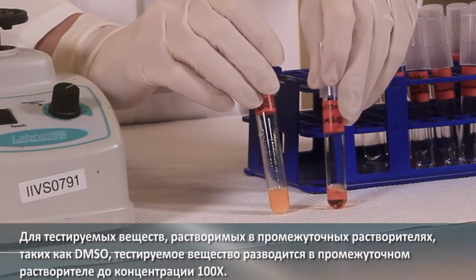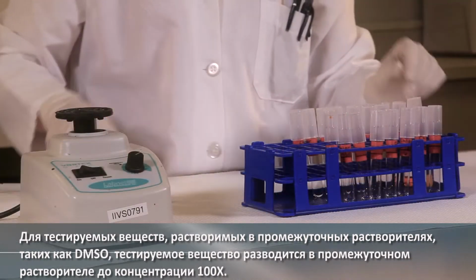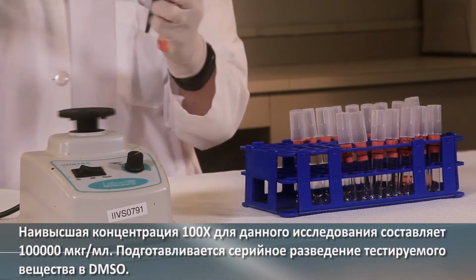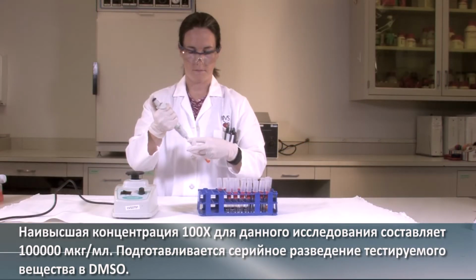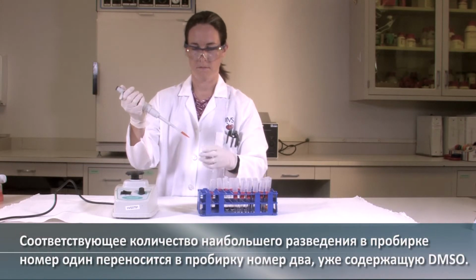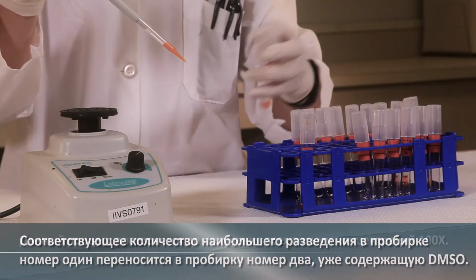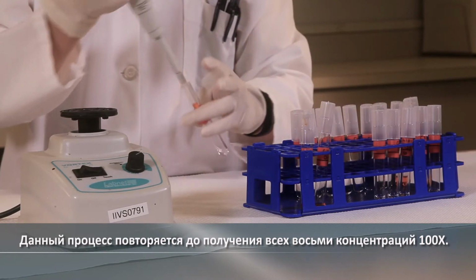For test substances that are soluble in intermediate solvents like DMSO, the test substance is diluted in the intermediate solvent to a 100x concentration. The highest 100x concentration for this assay is 100,000 micrograms per milliliter. A serial dilution of the test substance in DMSO is prepared. An appropriate amount of the highest dilution in tube number 1 is transferred to the tube 2 already containing DMSO. This process is repeated until all 8 100x dilutions have been made.